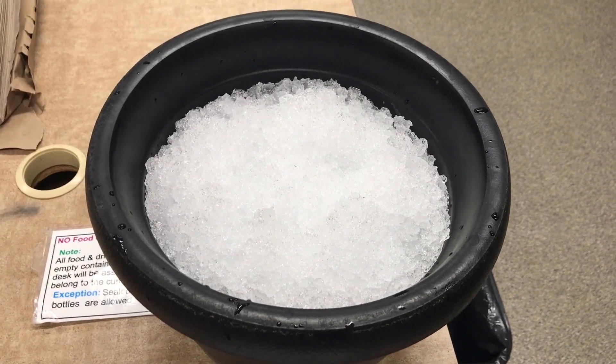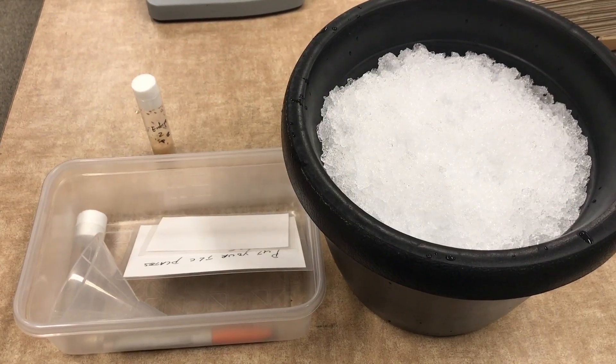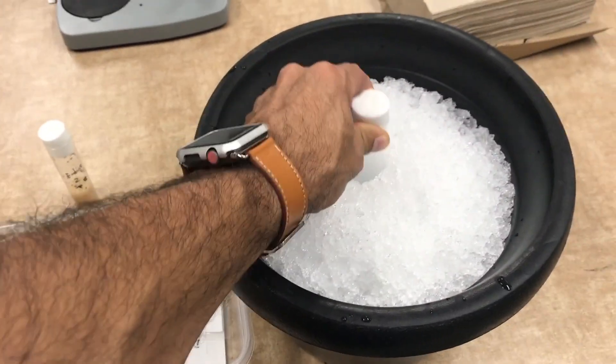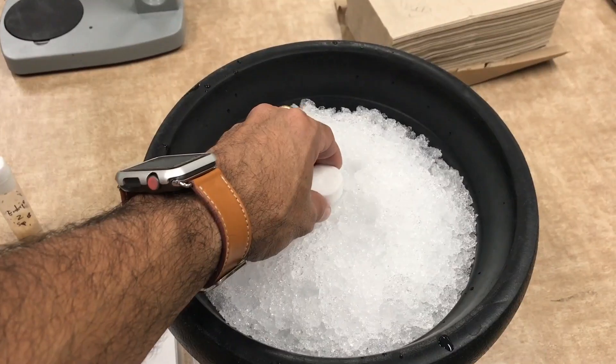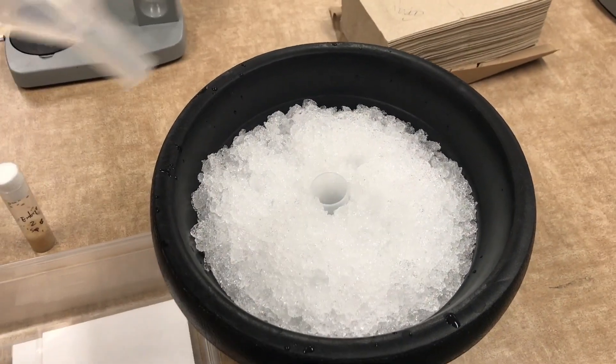You will also need ice because you need your flies to be sleeping. The first step is taking your empty vial and put it within the ice. Remove the lid and put the funnel instead.